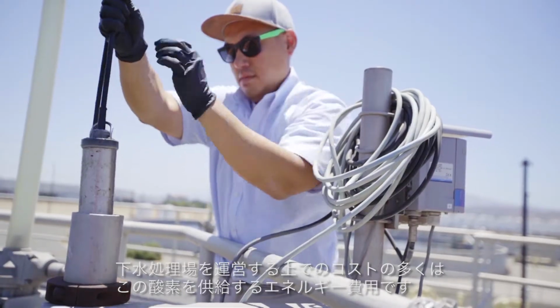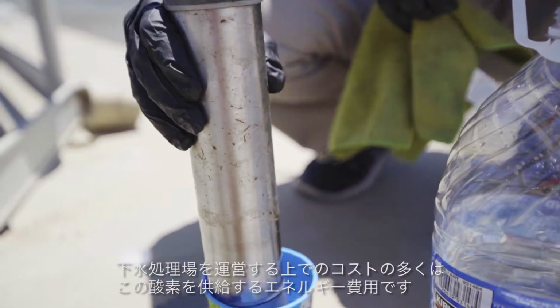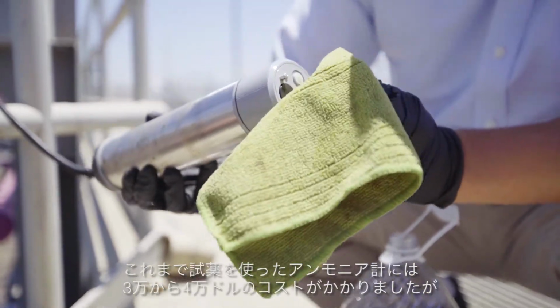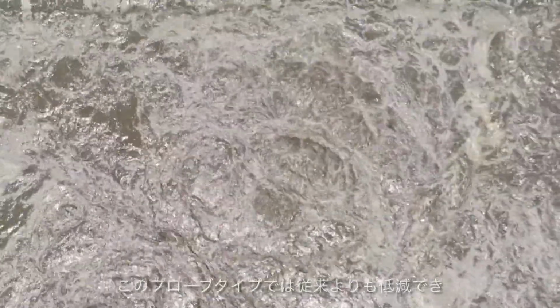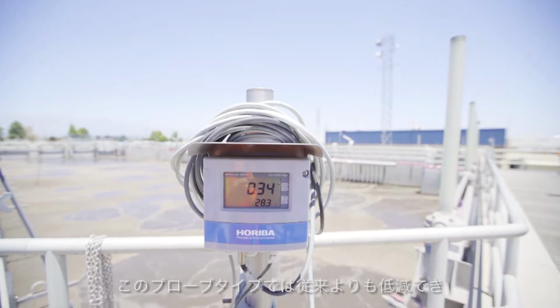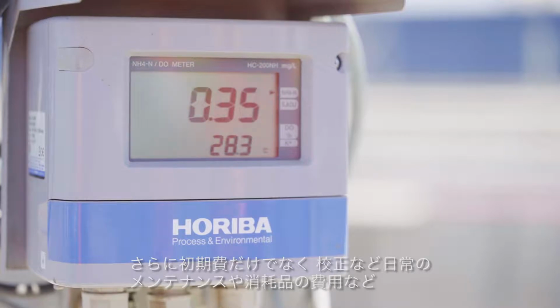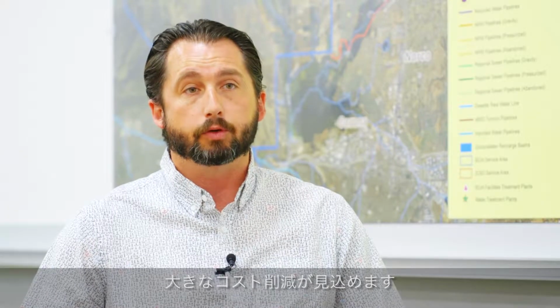The expense that comes in with doing nutrient control is, in order to do that, you have to get a wet chemistry ammonia analyzer. And those analyzers are in the neighborhood of $30,000 to $40,000, where a probe you could potentially get in that $10,000 to $15,000 range. So it's a huge cost savings from an O&M perspective on not only the upfront capital, but the routine maintenance that is required to keep these things up and going, calibrated, and whatever miscellaneous consumables you may have in a wet chemistry analysis.